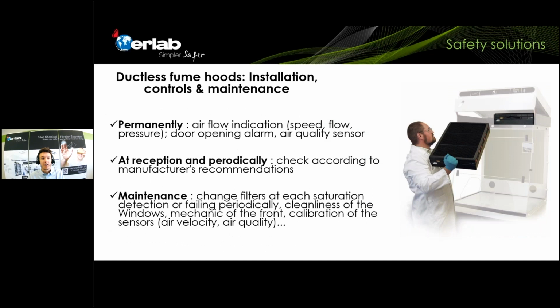So then again, for fume hoods, at the reception, look for a good installation. When you install, for example, filters that have captured toxic powders, you need to know the procedure to change those filters. Yeah, it's important to think about those things and to look for the best way possible to minimize the risk.